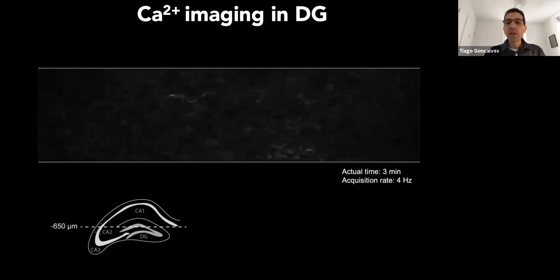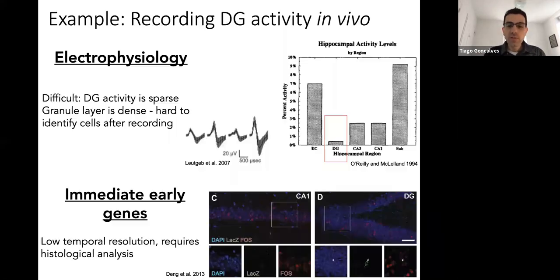This video is not necessarily darker, it may be a little bit darker, but what's happening here, if you look carefully, and hopefully you'll see this in your Zoom presentation, is that this is an extreme example of a population coding, meaning there's only very few cells that are responding during this movie. Very few cells are active. And this is actually a very, very packed area.